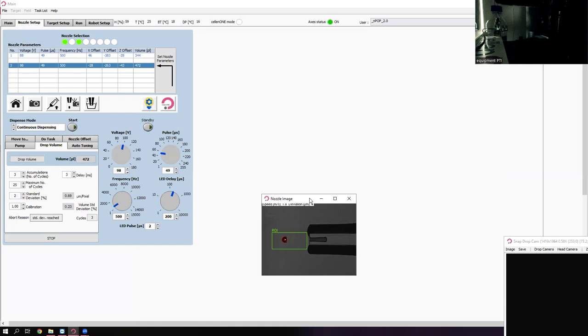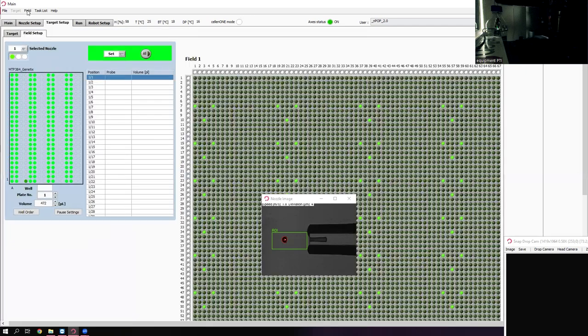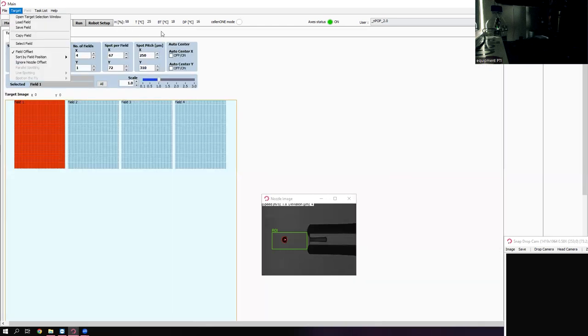So what you do is, we were just going to come in and start to run the beta. We clean the nozzle, we refresh the system liquid, all that stuff takes about 15 or 20 minutes. Then we will select the run, we load our target field file, which is that DMSO. We select the number of slides we're going to do.